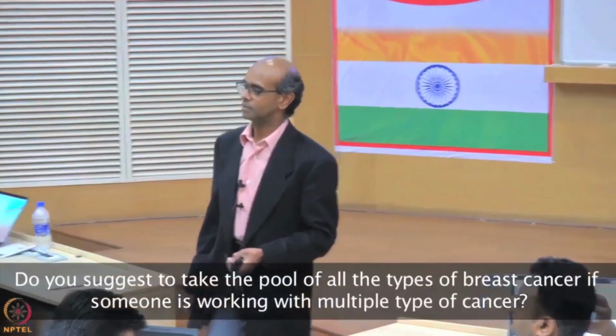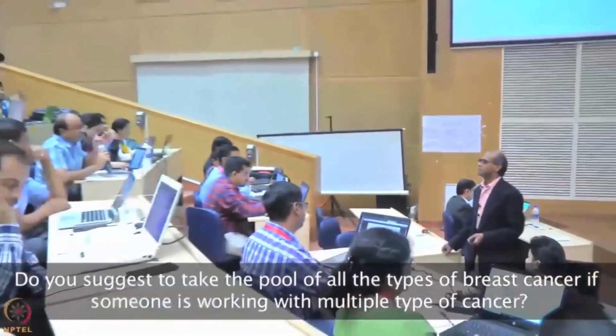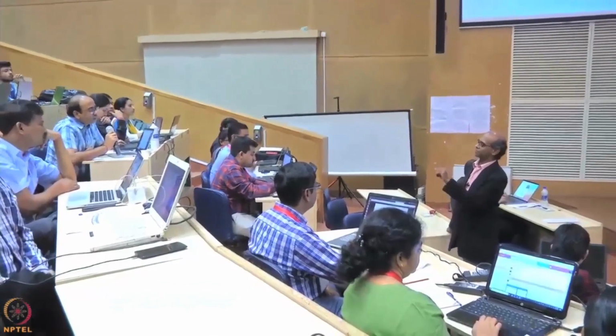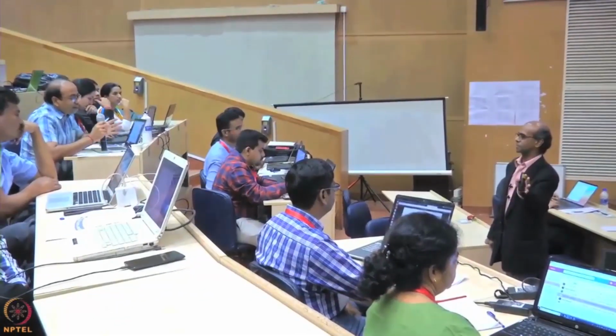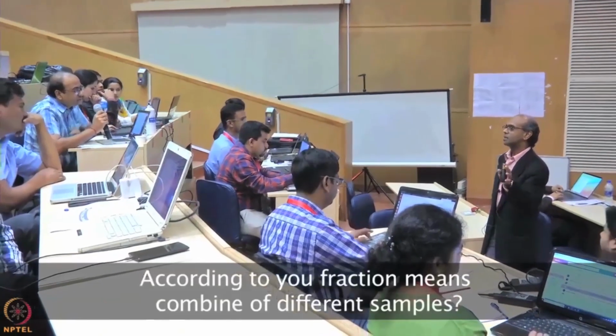So for all these projects, we didn't have any reference before we started. For the breast cancer project, we started by creating the reference. For the lung cancer, we started by creating a new reference. So you have to start by creating a reference. In breast cancer, you have several types of breast cancer. Yeah. No, but in the reference you have the same fraction of each of those as you have in your samples. If I say fraction, it means you are combining each different type of breast cancer.